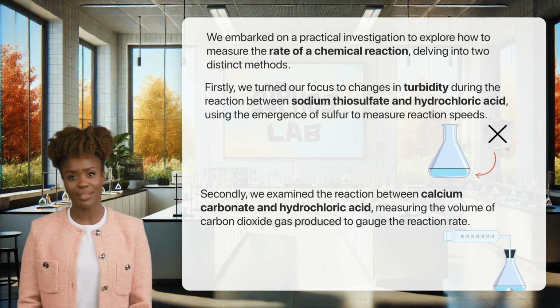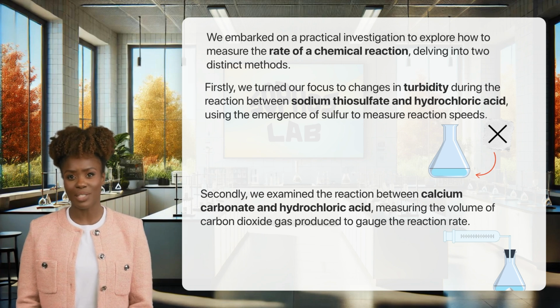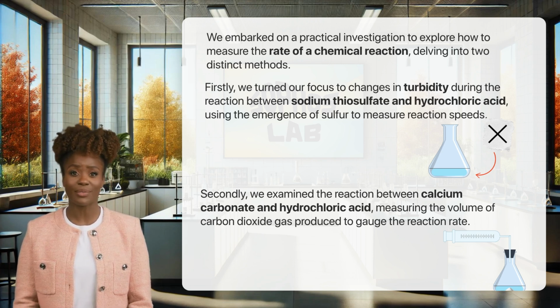As we continue to conduct practicals in chemistry, remember the importance of precise measurements, consistent methodologies, and safety protocols. Embracing these principles will refine your skills and deepen your understanding in future experiments.